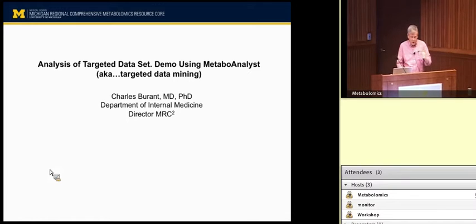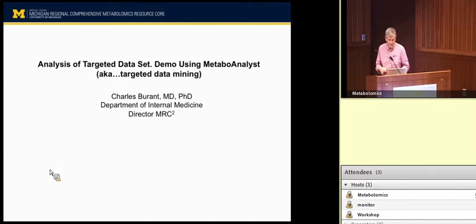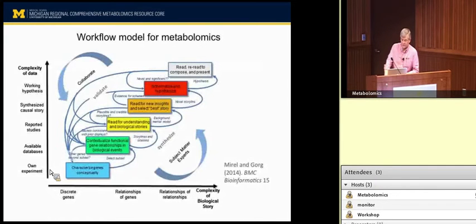My job is to talk about the assignment, which was looking at analysis of targeted data sets using a program called MetaboAnalyst. I've changed it a little bit because I started looking at what other people were talking about this afternoon, and it turns out I was overlapping with things going on today and tomorrow. So I've changed it to mining targeted data. I'm going to use the study I showed you earlier to show how we go about integrating the data with other data that we have.